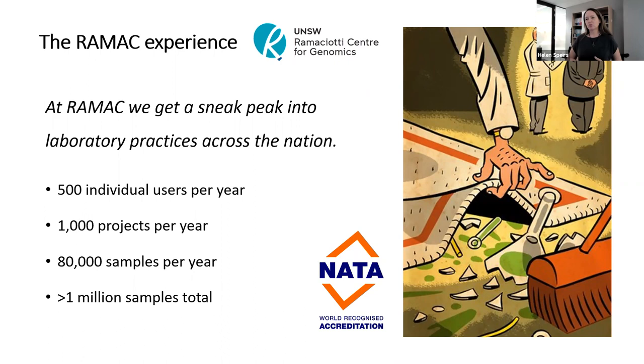So to share one recent example with you, and we have many, many we can share, a researcher submitted 24 plates of DNA samples to us, about 2,300 samples in total. When they arrived, there was liquid between the wells under the plate seal. So we contacted him and asked, what would you like to do? He said, oh, it's okay, I just left the plate sitting in the ice bucket and the water got in around the wells because the ice thawed. Well, we have to analyze those samples and produce a certain amount of data at the end.